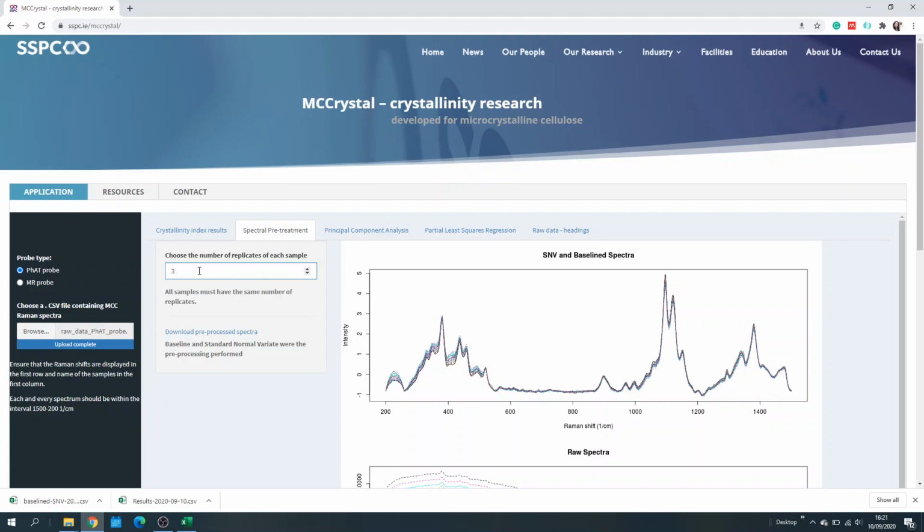For example, if I want to say 40, that doesn't really make sense, because what the program is doing is averaging every 40 lines, and I know that I only have 60. So it is averaging the first 40 and assigning to the first sample, and then trying to average the next 40, but I would have just 20 to be averaged there.